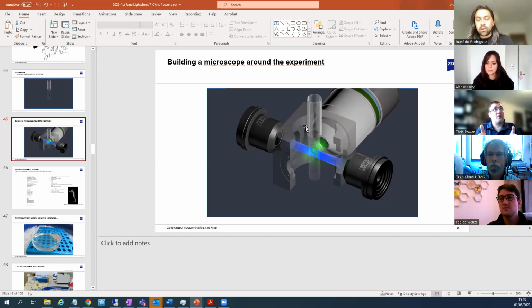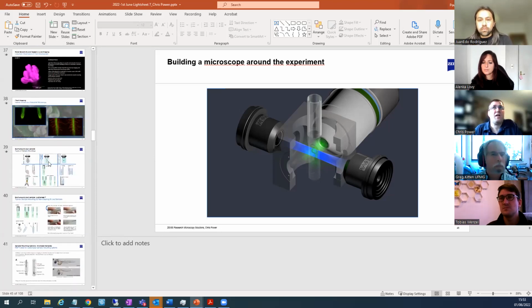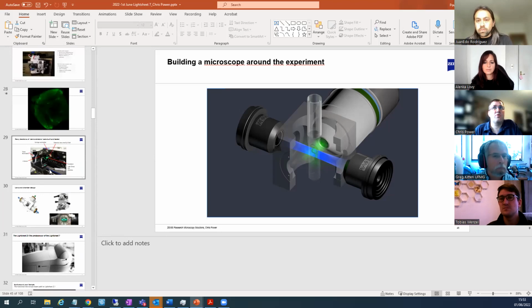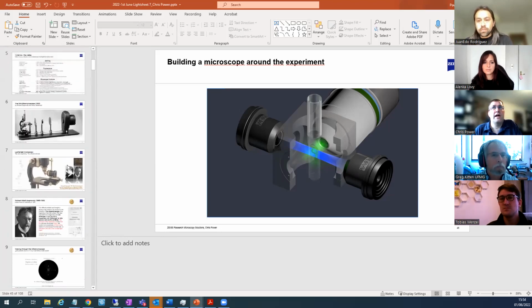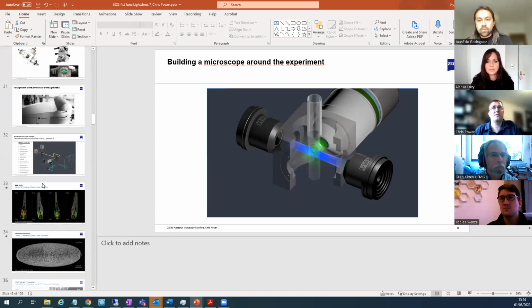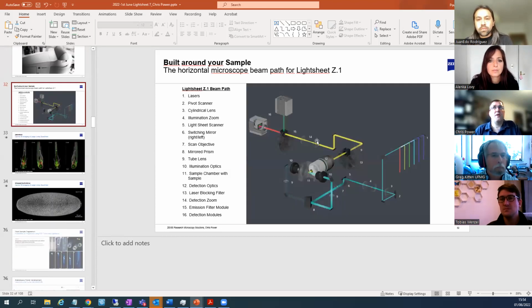So usually on a system we would say, do your water samples on a Monday and Tuesday and your cleared samples on a Wednesday and Thursday. So you're not changing all the time, but it's not that bad. The other thing is that one of the reasons for changing the chamber and the lens on a normal microscope is to adapt the field of view. And I don't think I mentioned it specifically: on the light path here, there's a really good zoom lens, which goes from 0.3 to 2.5.